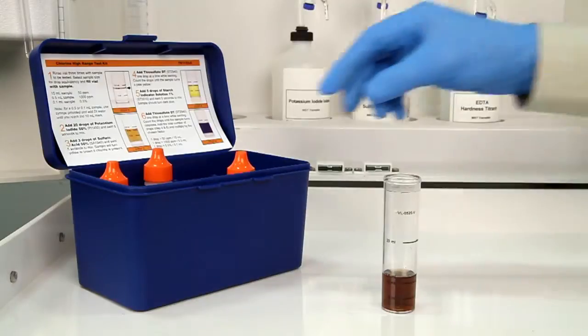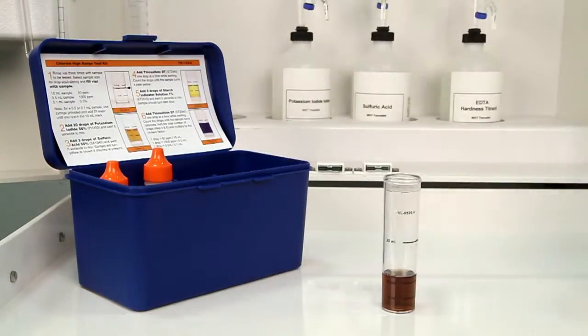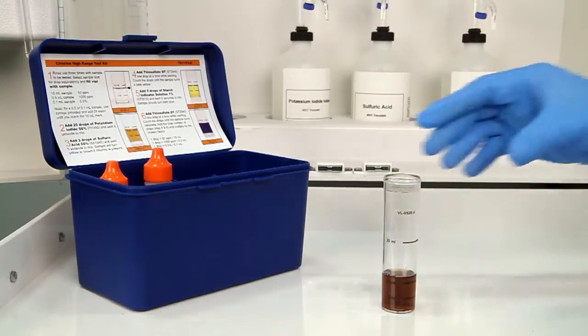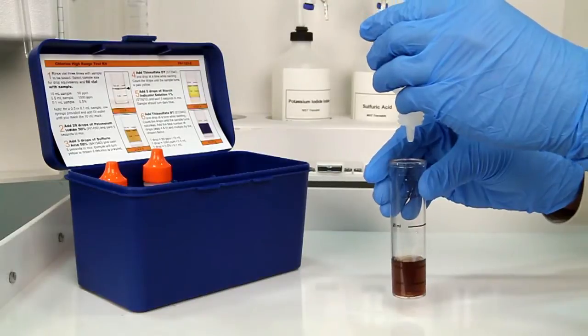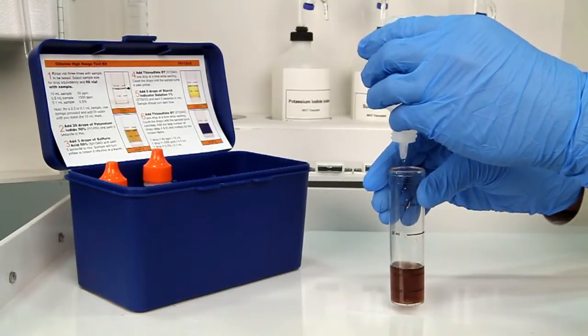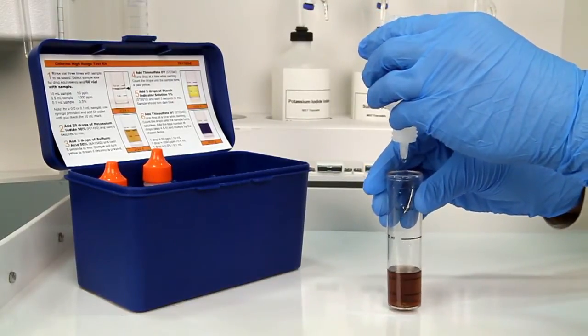The next step is to perform the second titration using thiosulfate DT. It's important to make sure you have the proper titrant and the proper sample size for this titration. Remember to hold the bottle vertically to get a consistent drop size.